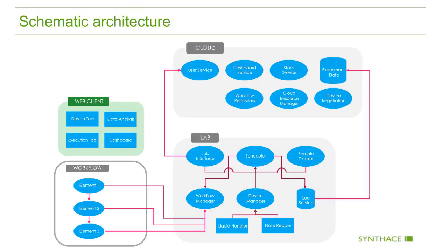And of course, all of the data and all of the events about what is actually producing these experiments and what's happening during the course of running them is being collected into the log service, which under the hood consists of both a NoSQL database, CouchDB, and also special time series record logs so that you can overlay information from things like environmental sensors, which is great forensics data when you're trying to figure out whether any particular data point is truly a black swan or just a result of experimental error.